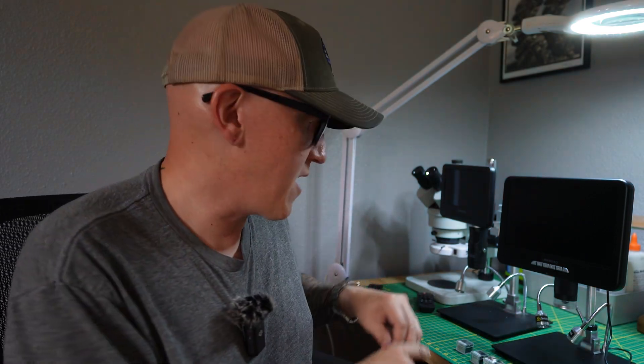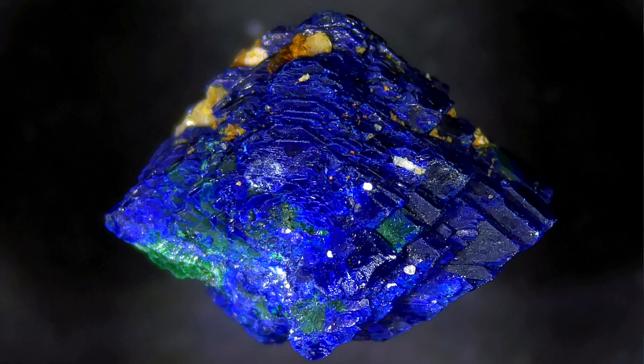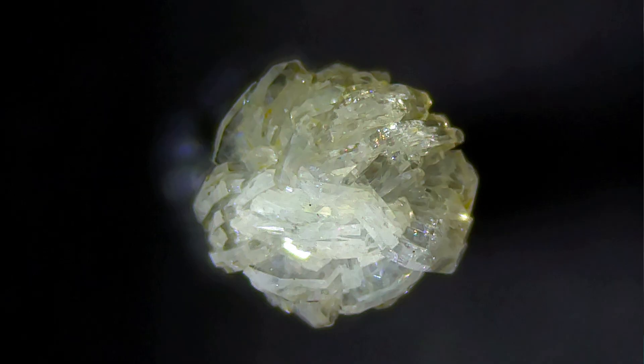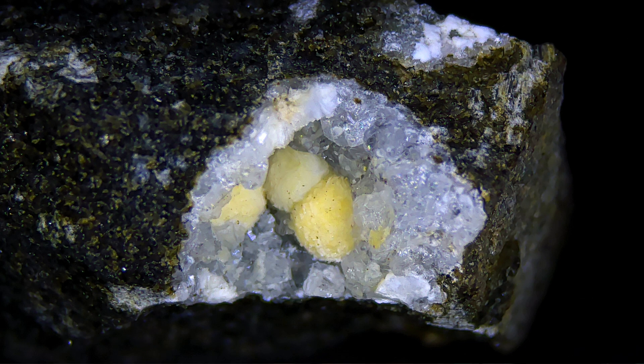The photos — I'm going to show you here the five photos that I took with the new setup — and the photos are not great. I do not know what is happening with these digital microscopes. They can take pretty good, very serviceable video, but the photos are kind of bleh, to be honest. However, you can always take a still frame out of a video, and I've done that. Taking a still image out of video looks way better. So you can still kind of get a picture out of it.